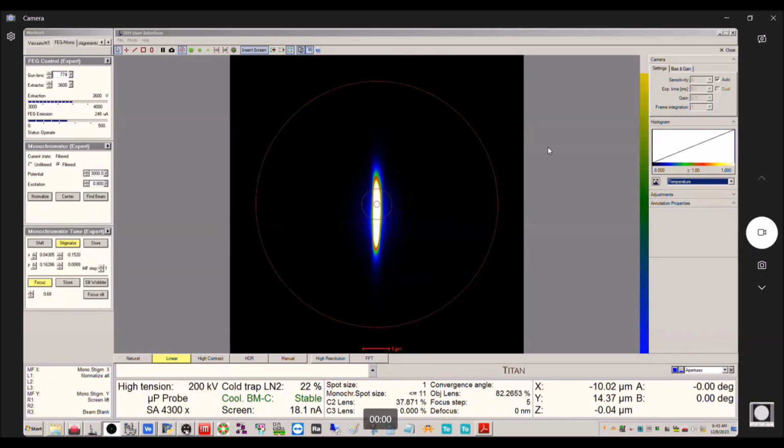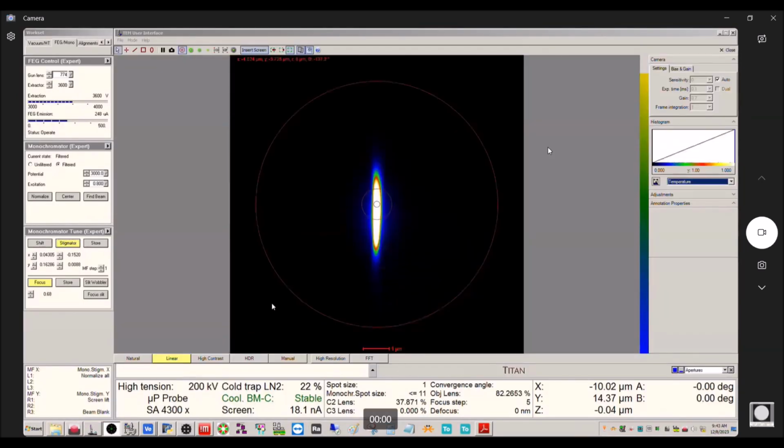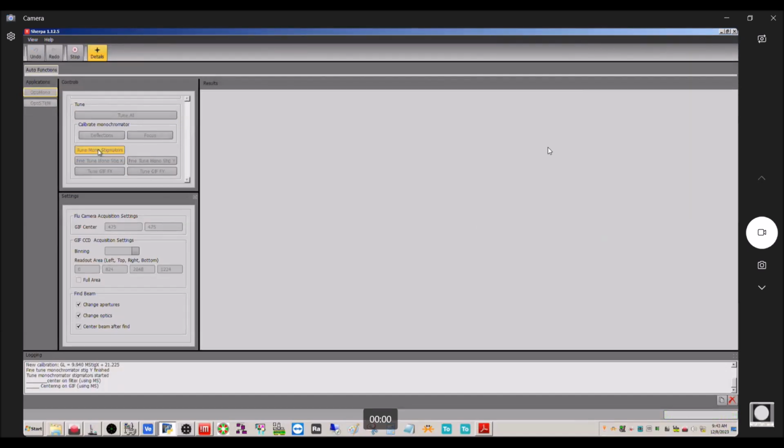Let's see here. Are we back here? Oh, come back. Let's run these again, just for the sake of doing it. Tune the stigmators.